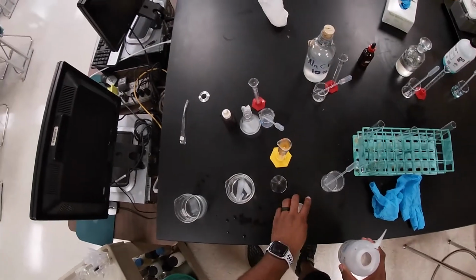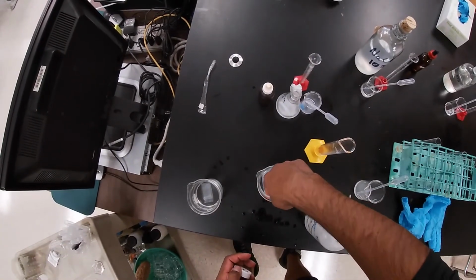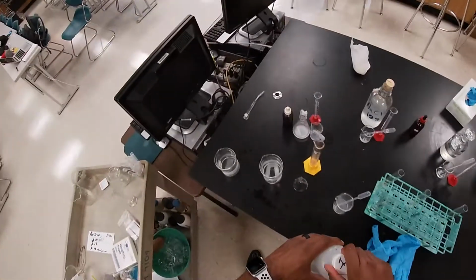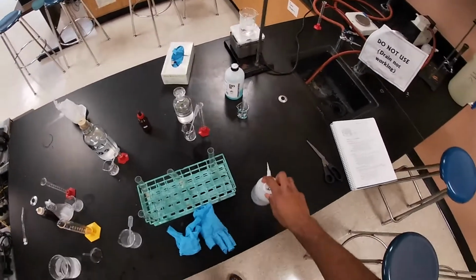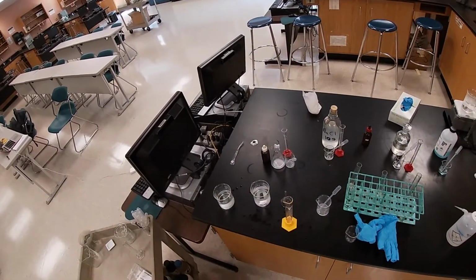Okay, and as we completely submerge it, let's see if I can submerge it completely. There you go. And then once we completely submerge it, the next thing that we have to do is we're gonna get a test of a solution. So now we need 3 test tubes.